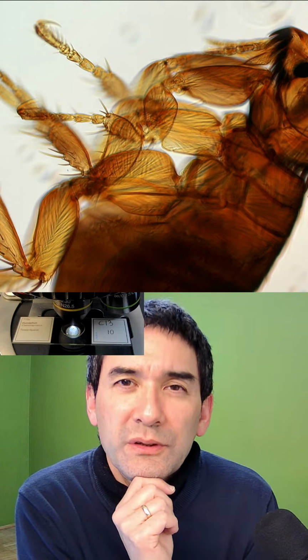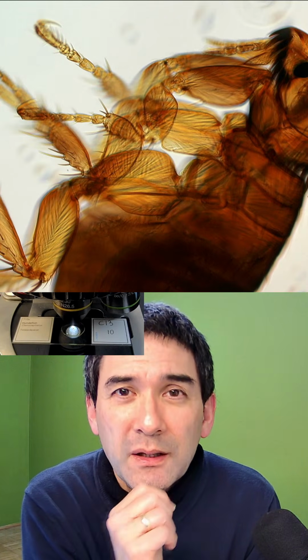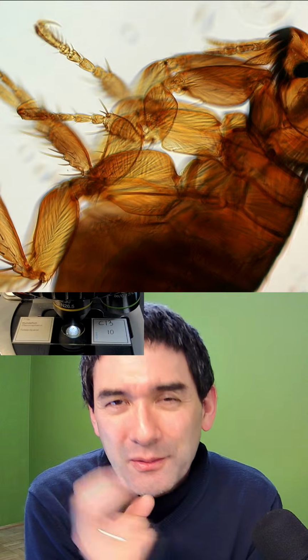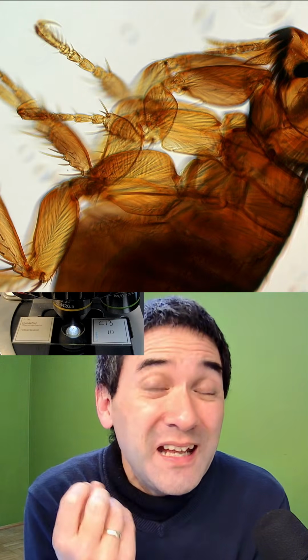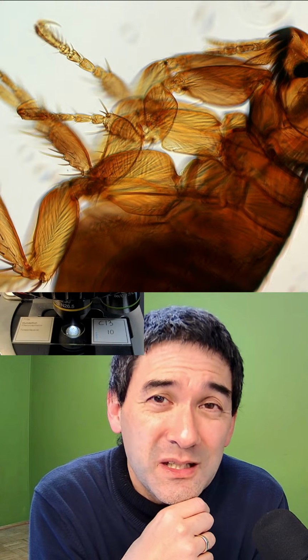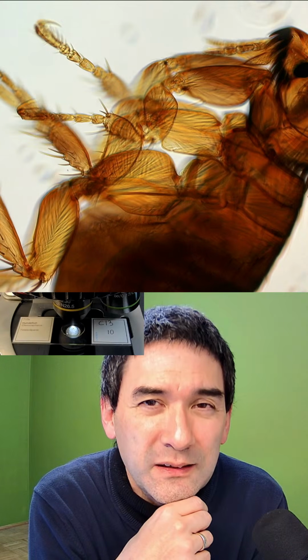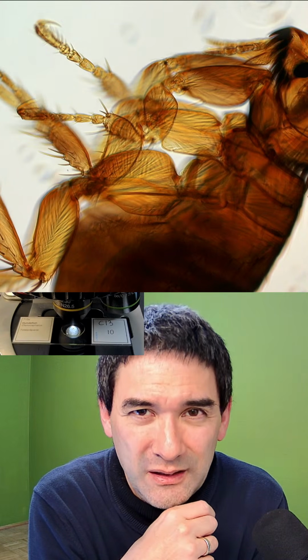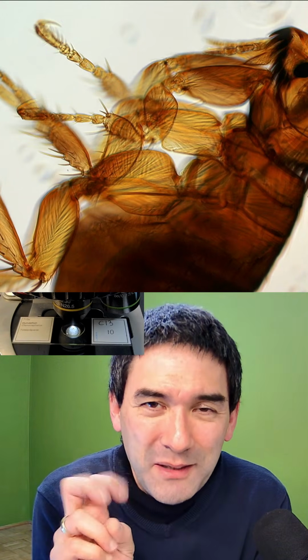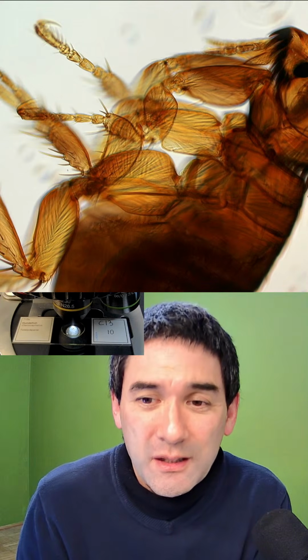When you're taking a natural sample, a pond water sample or whatever, there's so much dirt in there, dirt in quotation marks, that sometimes it doesn't make a huge difference if the slide is perfectly clean or not. I'm just saying the biggest contamination, in quotation marks, actually sometimes comes from the specimen itself.